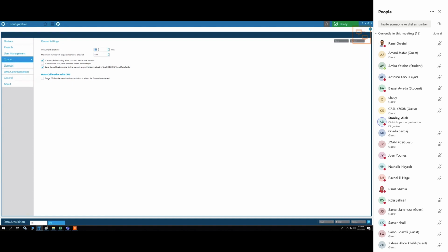So the instrument never turns off. The electricity is there all the time. The vacuum is there all the time. But the things that are using heat or pressure will stop. It means you will need to budget your HPLC solvent 20 minutes extra from the end of your last run. Yes. Thank you.